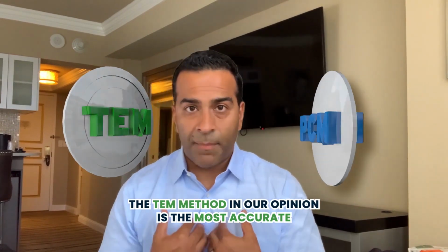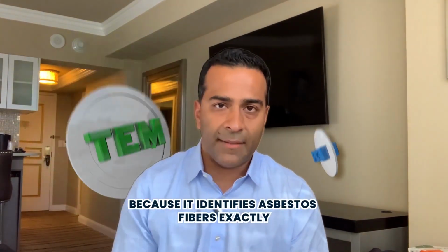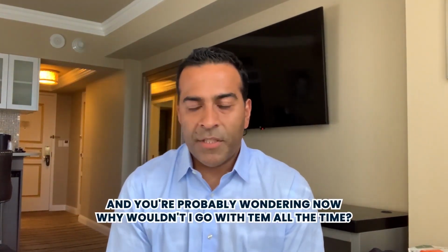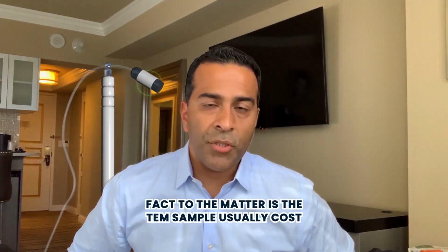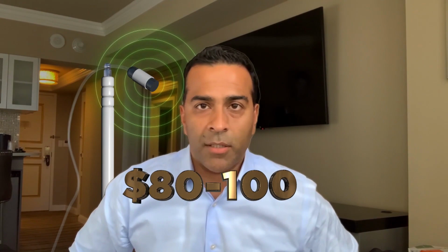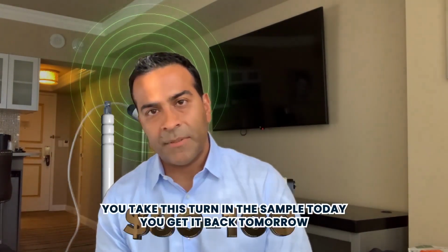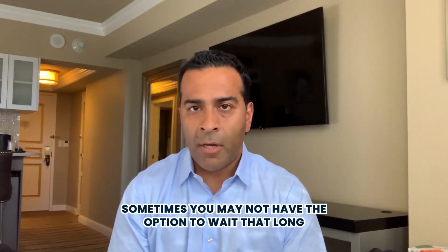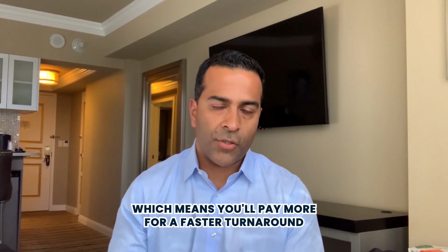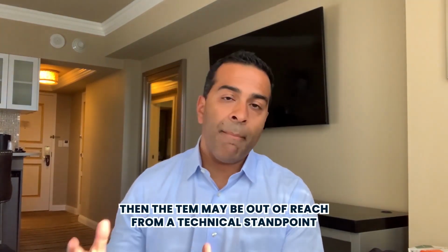The TEM method, in our opinion, is the most accurate and the best option whenever your budget allows, because it identifies asbestos fibers exactly. You're probably wondering, why wouldn't I go with TEM all the time? Great question. The fact of the matter is the TEM sample usually costs anywhere from $80 to $100 per sample for a one-day turnaround, which means you turn in the sample today and get it back tomorrow. Sometimes you may not have the option to wait that long, which means you'll pay more for a faster turnaround. But if the price per sample isn't feasible, then the TEM may be out of reach.